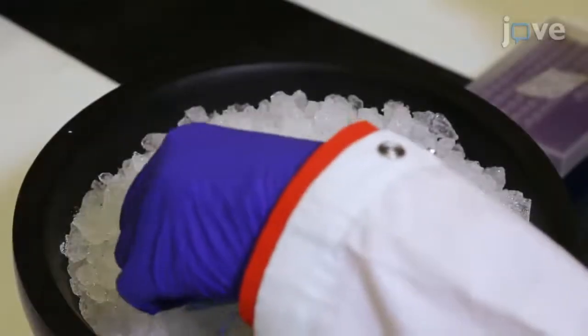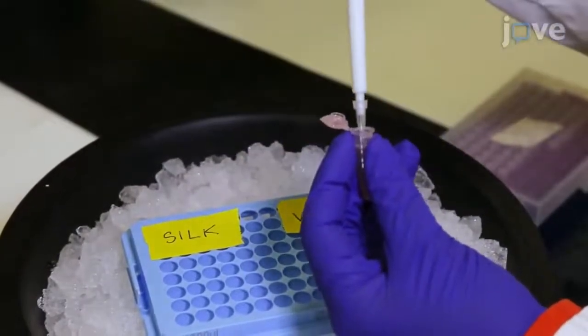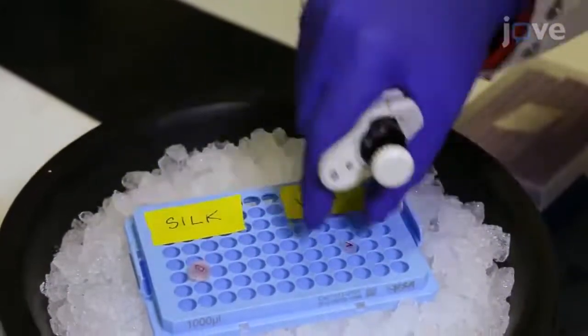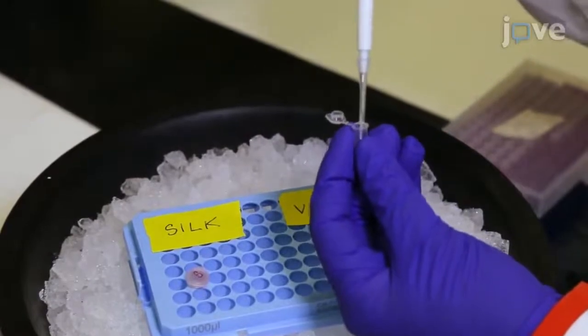First, mix thawed AAV and 5-7.5% aqueous silk fibroin in a 1-to-1 ratio in a 200 µL PCR tube. Gently pipette the solution in and out several times to thoroughly mix the AAV and fibroin.